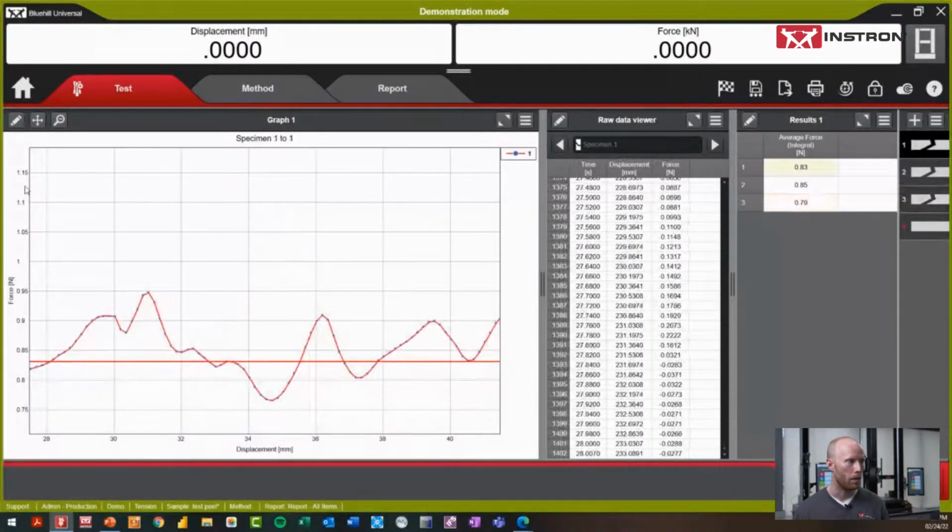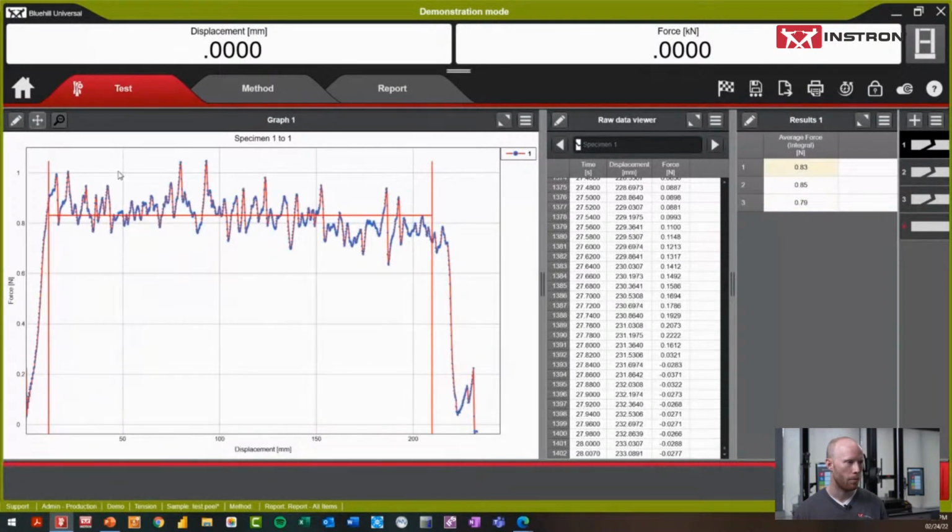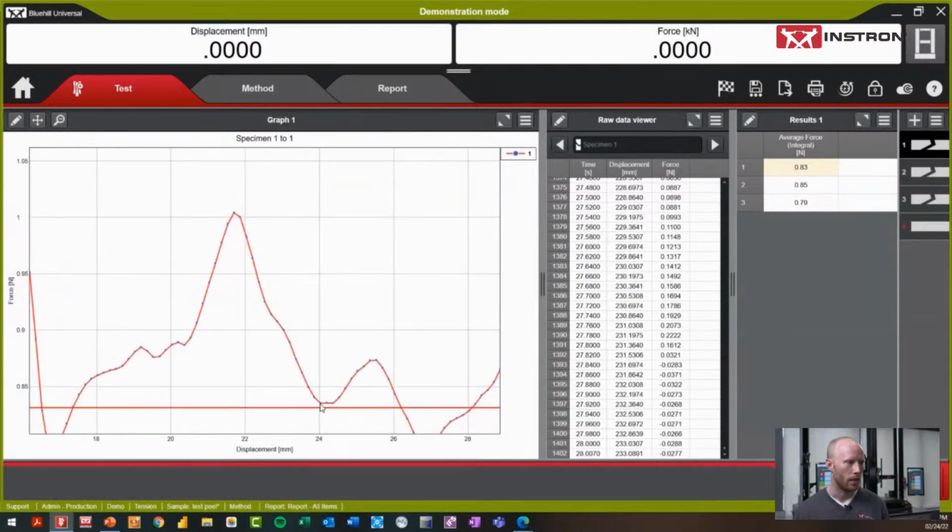Whereas if we go to maybe the first sample and we did the same evaluation, we could try to see if we have that 10 to 50 data points, which seems to be certainly much more in that realm. So the default value here is actually pretty appropriate.